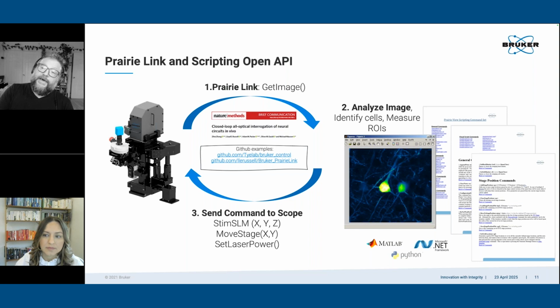There's a method you can implement to move the stage slowly. You can pull images and do a cross correlation on either a separate computer or a separate set of code that you can write, and you can tell if the system is drifting in X, Y, and feed back to the microscope to move. That's how people generally deal with long scale drift, because if your image drifts out of your field of view, you can't motion correct it. For rapid motion correction, like heartbeats, I mean, even fruit fly brains pulse as well, this is typically done post hoc.